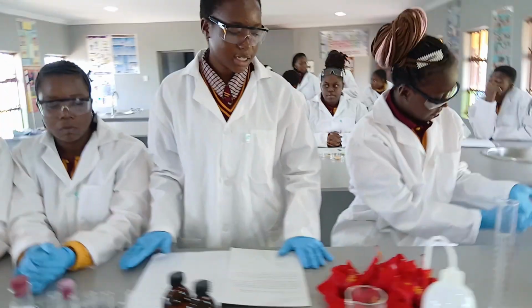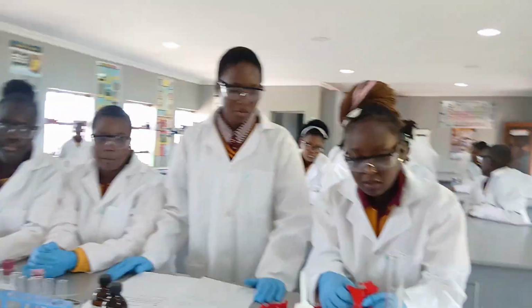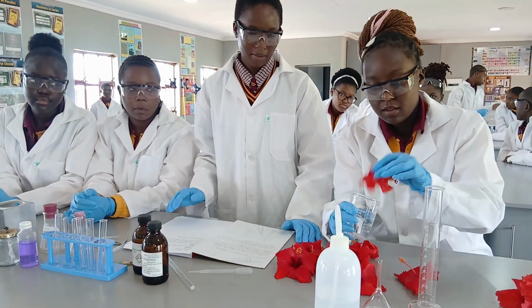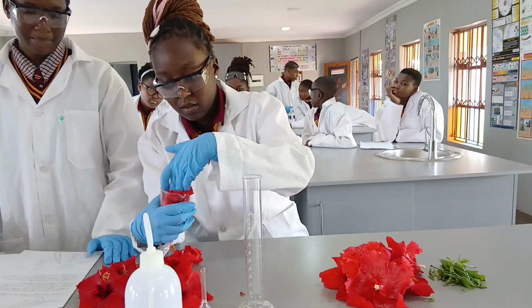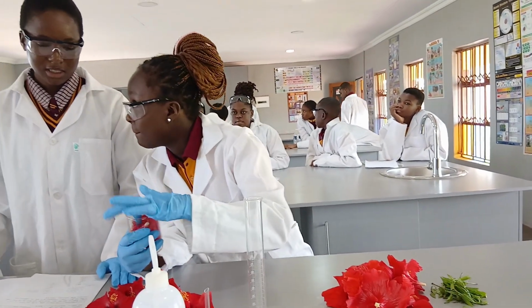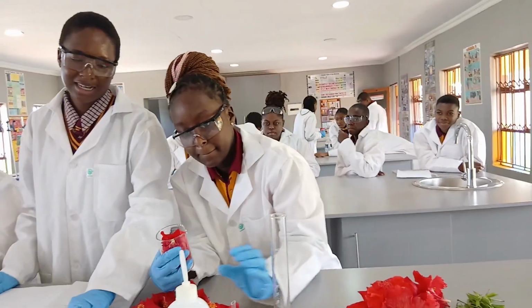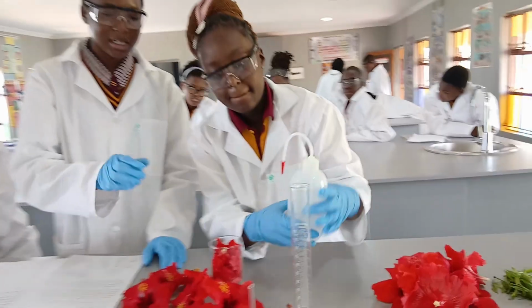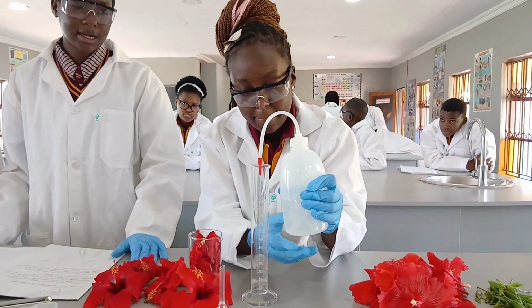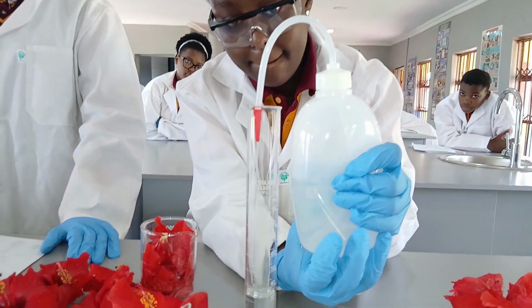So firstly, we'll need about 10 to 15 grams of hibiscus flower, and we'll be placing them into our beaker. And then we'll measure our water using our measuring cylinder. So we are going to measure our distilled water up to 100 milliliters.